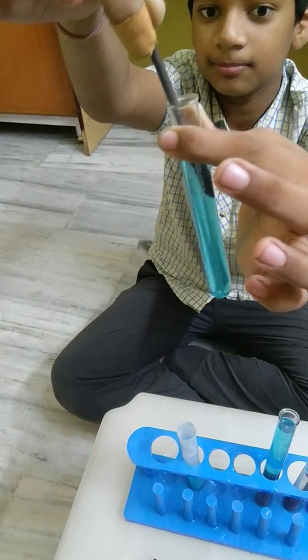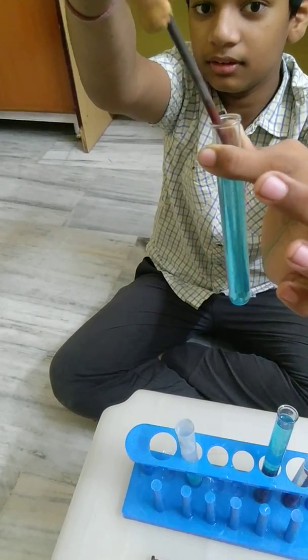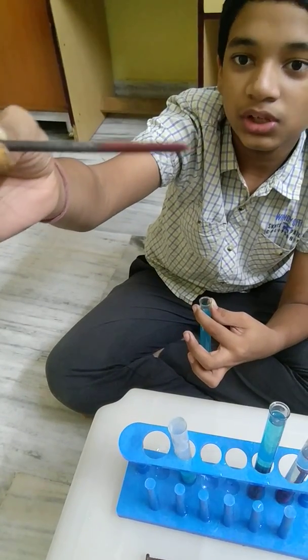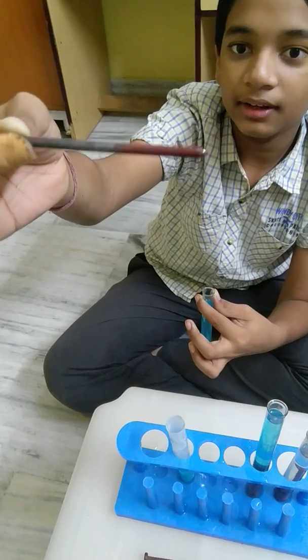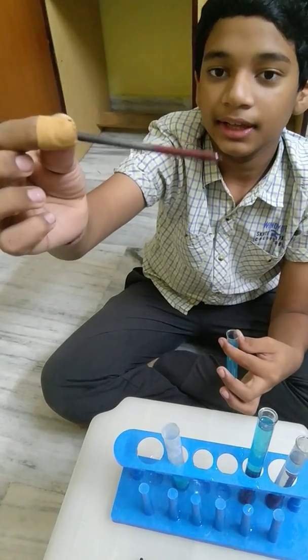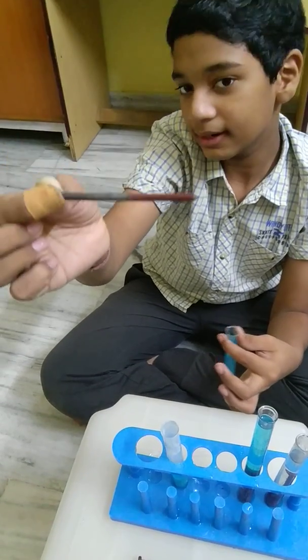10, 15, 20. And when I get it out, you can see a brownish layer has formed around the iron nail. Many people think that this is rust, but unfortunately they are wrong, because this is a coating of copper on the iron nail.